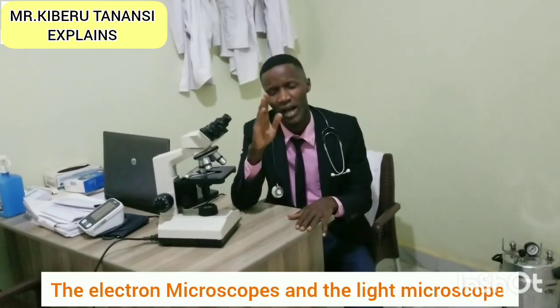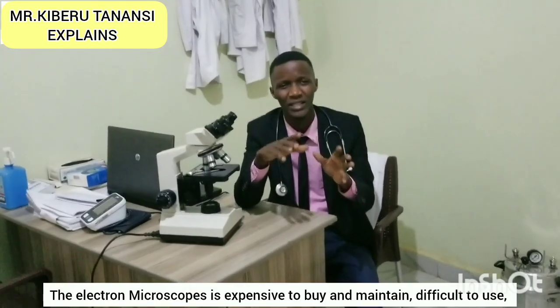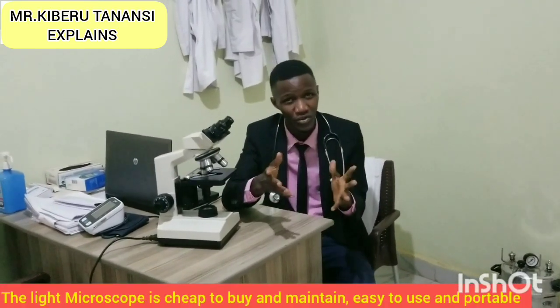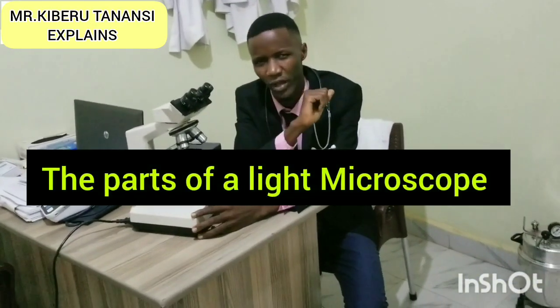So my senior learners, when we are studying about the microscope, last time I told you we have types of microscopes. We have an electron microscope and the light microscope. I told you the electron microscope is expensive, difficult to use, and expensive to maintain, but the light microscope is cheap, easy to use, easy to maintain, and that's the reason why in our facilities we use those light microscopes. So here with me is the light microscope, and I'm going to take you through the different parts of this microscope.